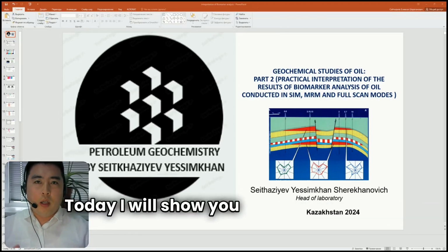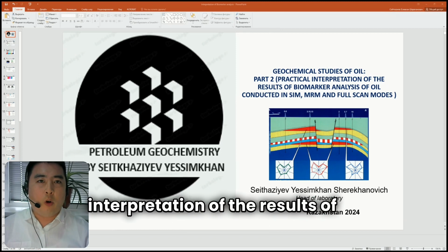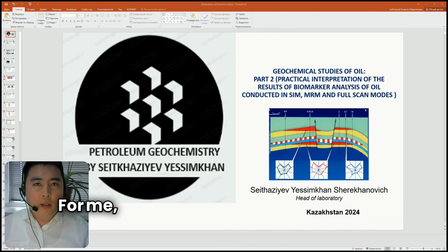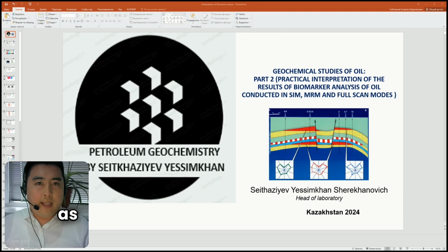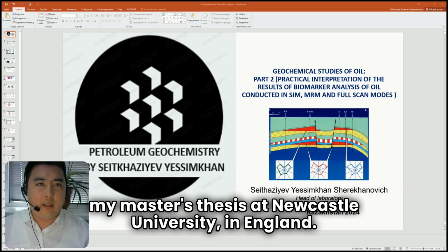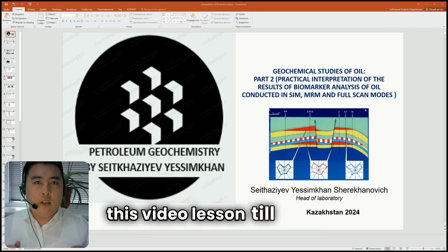Today I will show you a very important video lesson on geochemical studies of oil, part 2: practical interpretation of the results of oil biomarker analysis carried out in SIM, MRM and full scan modes. For me, this topic is very interesting and important as it is completely related to the topic of my master's thesis at Newcastle University in England. If you want to interpret the results of biomarker analysis yourself, I recommend watching this video lesson till the end.